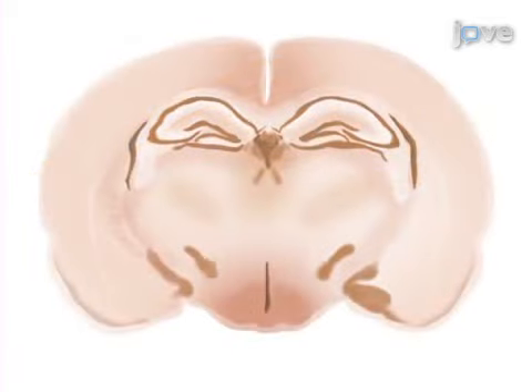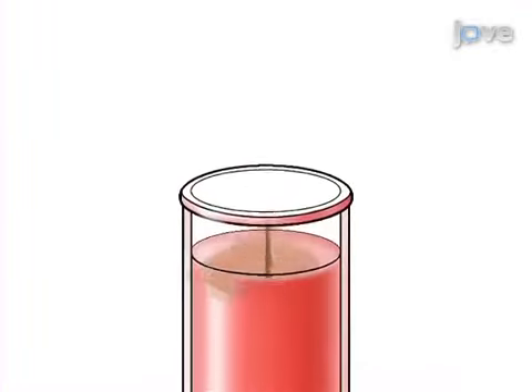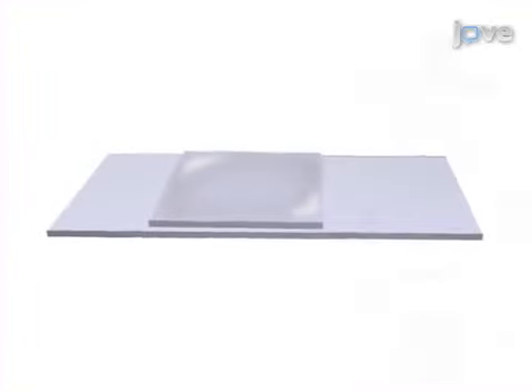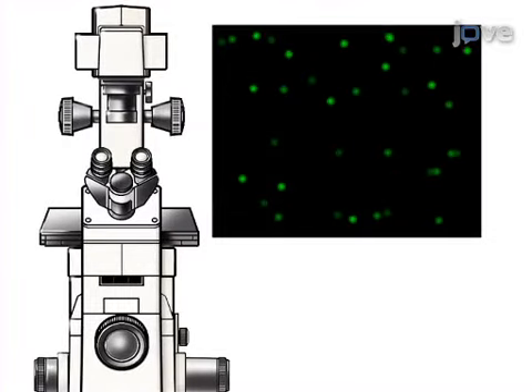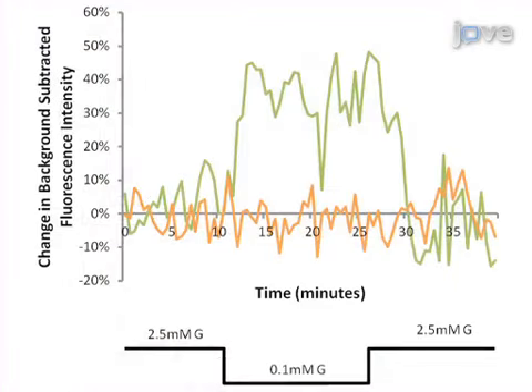The second step is to create coronal brain slices and dissect the VMH. Next, the VMH neurons are dissociated and cultured on coverslips. The final step is to measure the fluorescence of the neurons as glucose is decreased in the presence of membrane potential dye.